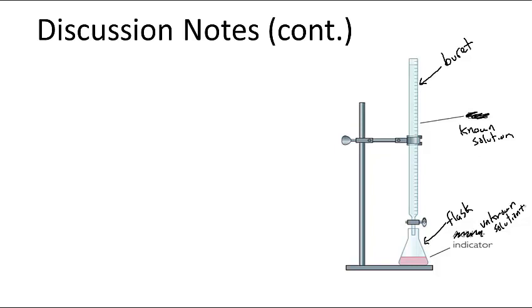We have indicators to measure all sorts of different pHs. You saw the universal indicator that could measure over a wide range. I think they have a number of different molecules in there that do that. The cabbage juice can also do it over a broad range, but that's not as exact as what we would want. So you wouldn't use cabbage juice normally for a titration. You would pick an indicator with a very clear change from one pH to the next based on the conformation of that molecule.